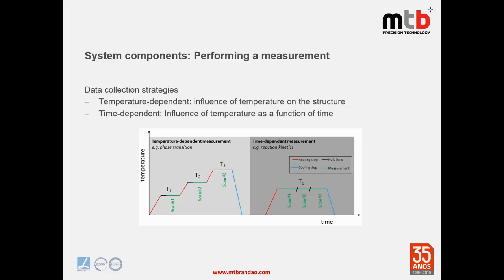The hold time is an optional step before performing measurements, giving the sample time to equilibrate at the set temperature. The length of the hold time depends mainly on the heating/cooling rate applied, the thermal properties of the sample, and in general, longer hold times are required for faster heating rates. Typical hold time values range from one to five minutes.